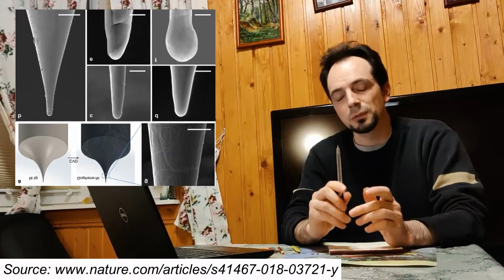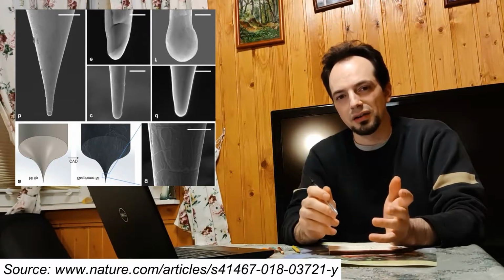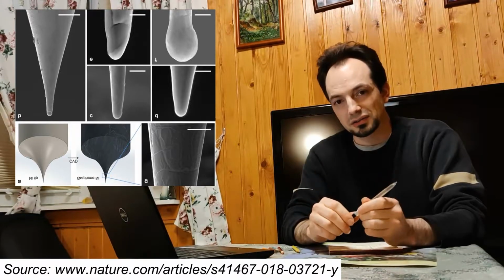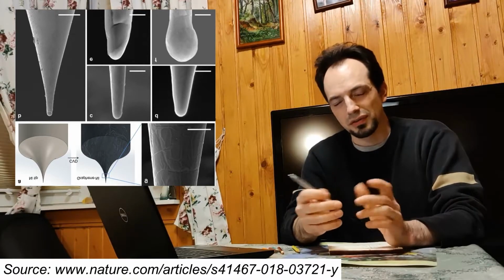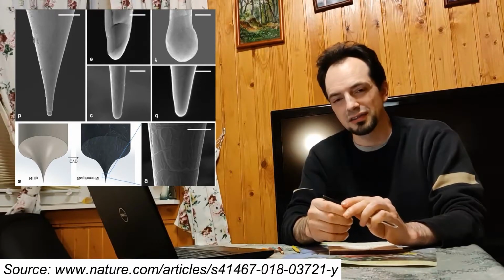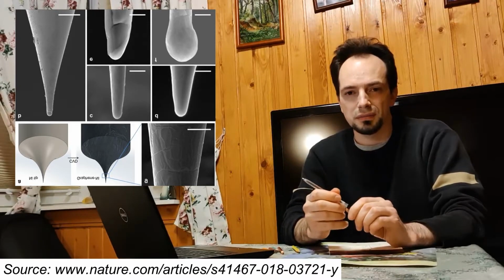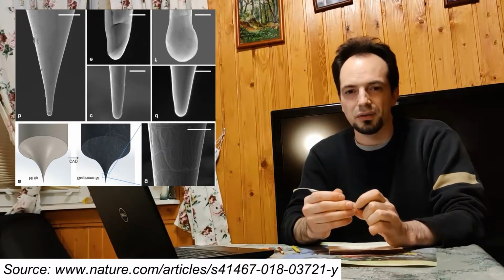The final option is a so-called field emission cathode, which is just a needle, but a very thin one, which emits by means of auto emission in quite a high electric field intensity. If we apply quite high electric field intensity to a very sharp needle, the electrons would start to fly off the tip of the needle, and that's it. No auxiliary heating required in this case. This type of cathode gives the most thin and narrow beam, but it has its own drawbacks also. Not the best intensity could be drawn out of this type of cathode.